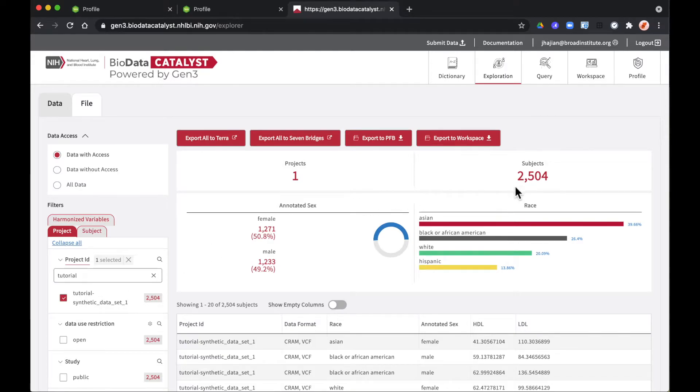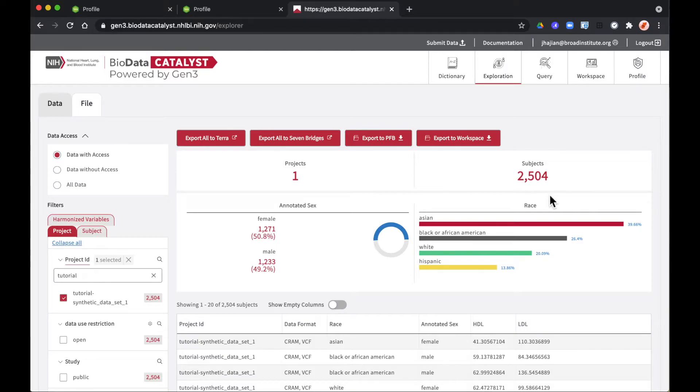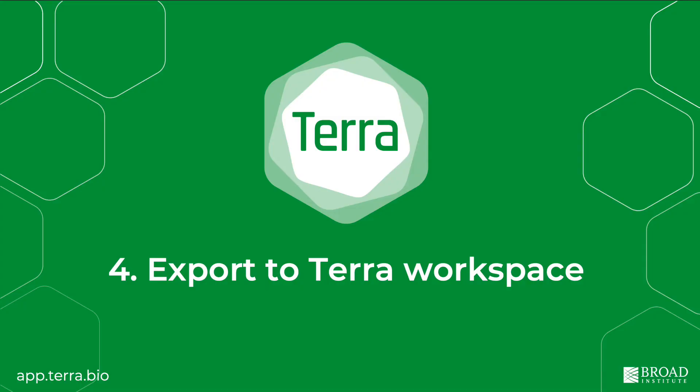You'll see the number of subjects in the data set you've chosen here at the top right. Once you have that you're ready to export it to Terra. Gen3 will export all the data that's associated with the subjects you've chosen.